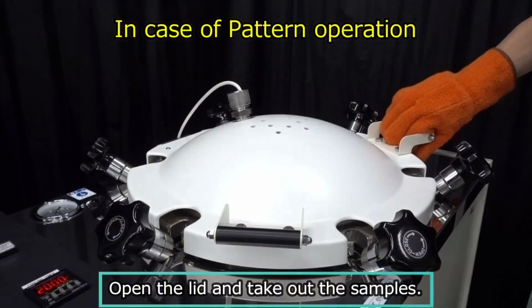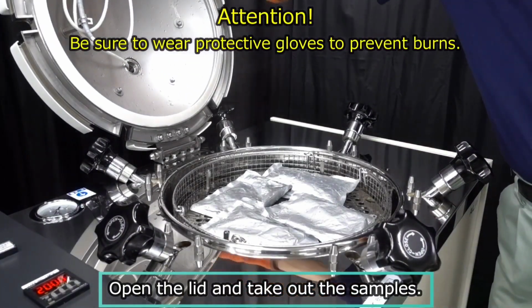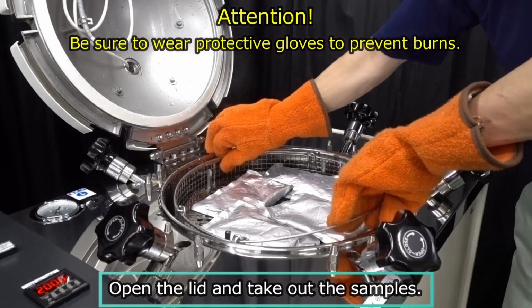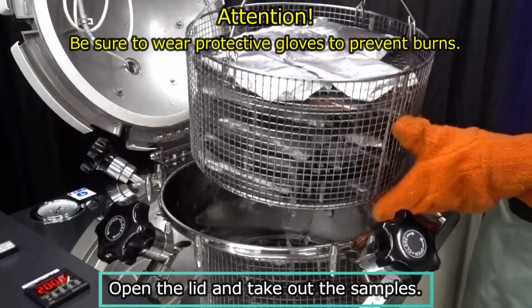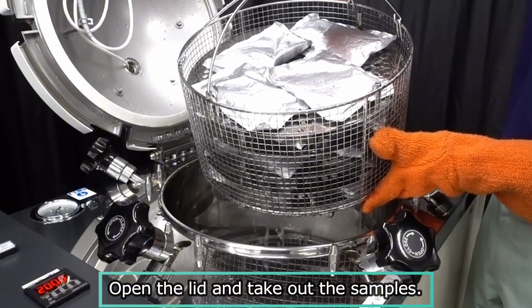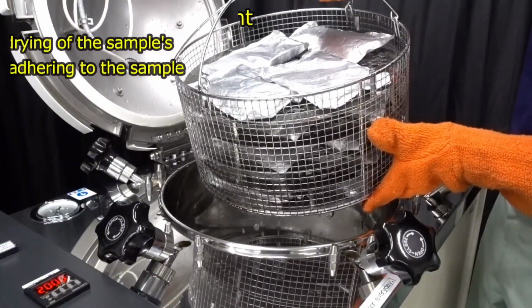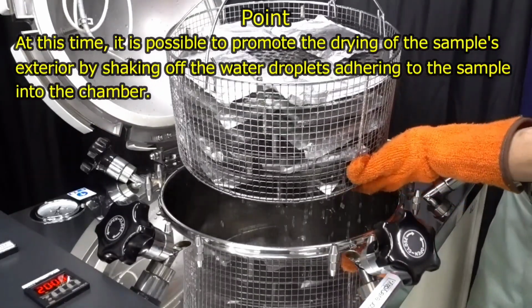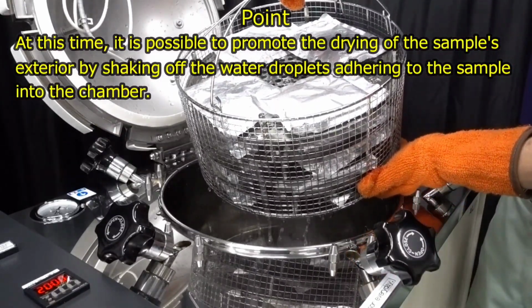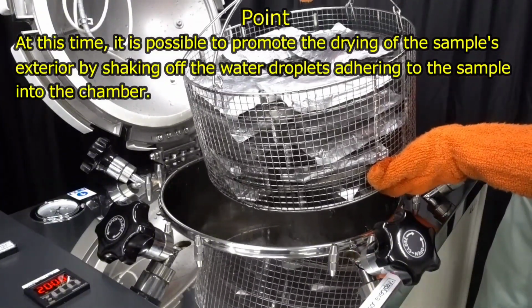In case of pattern operation. Open the lid and take out the samples. Point: at this time, it is possible to promote the drying of the sample's exterior by shaking off the water droplets adhering to the sample into the chamber.